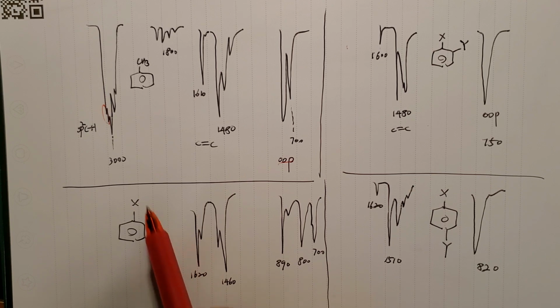But when you have a big electronegative or resonance group, then the molecule becomes polar and they can grow out of the bending vibration, then you may notice more than 4. But anyway, those two are distinctive ones, usually even with the nonpolar groups. So you want to remember based on these two. So I hope you see the pattern.